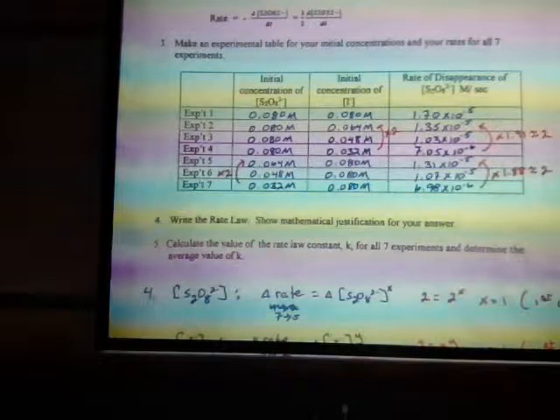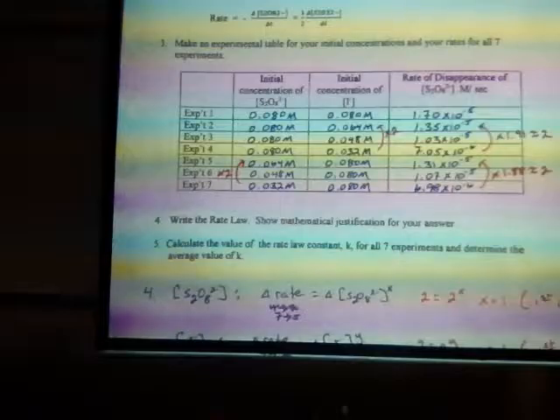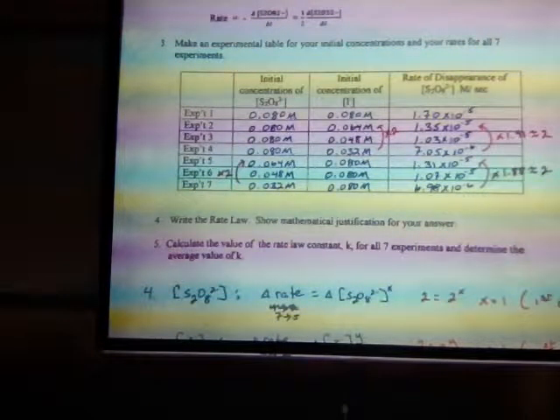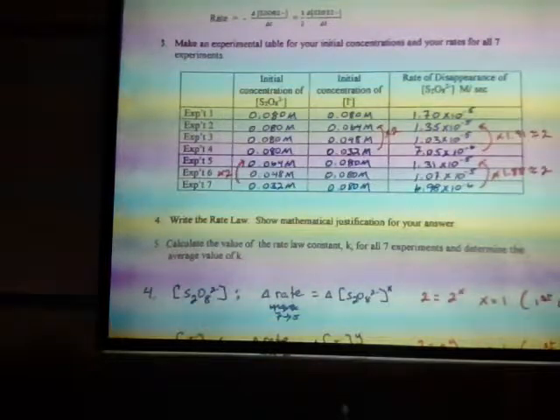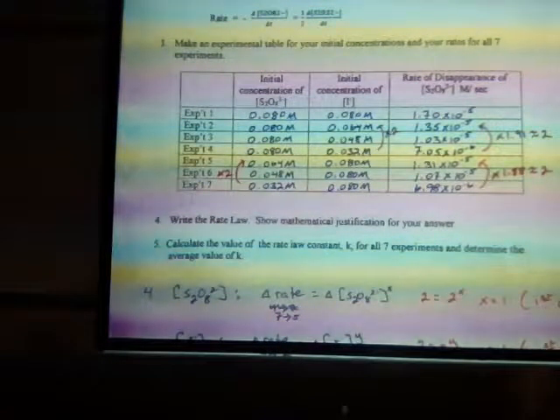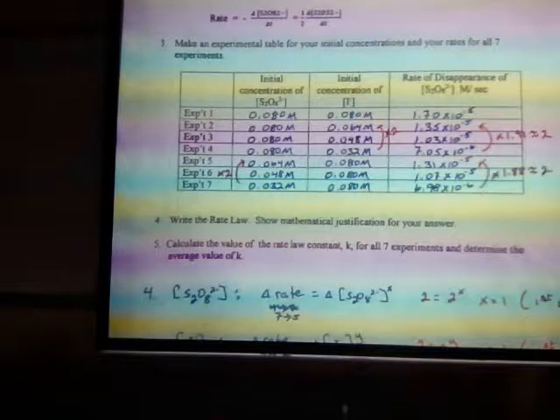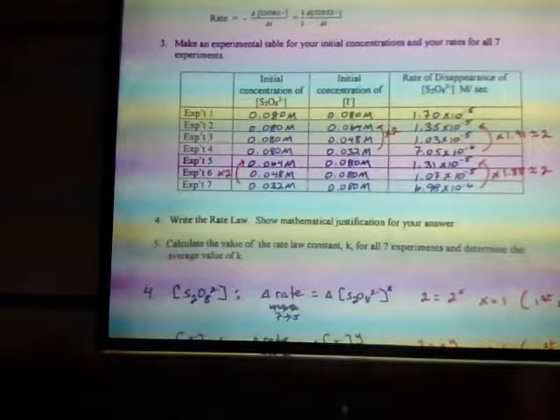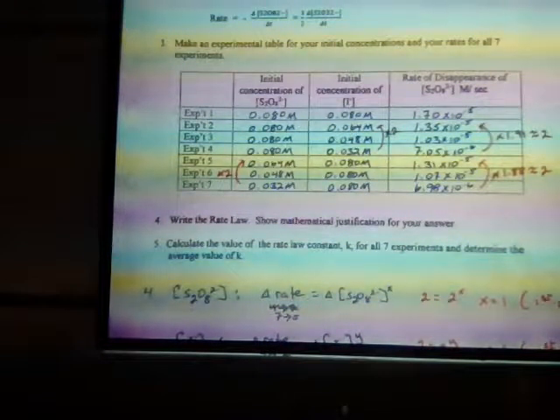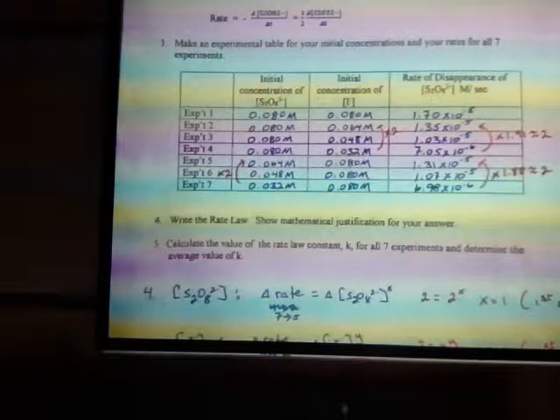Some of y'all may have waited to stop it until it went completely blue, versus some of y'all went when it first started being blue, which is, by the way, when you were supposed to do it, when it first started turning blue. Okay? Some of y'all maybe looked away and then said, oh, crud, and then stopped it. Some of y'all may not have put starch in and just said, well, it turned yellow. Okay? All right?